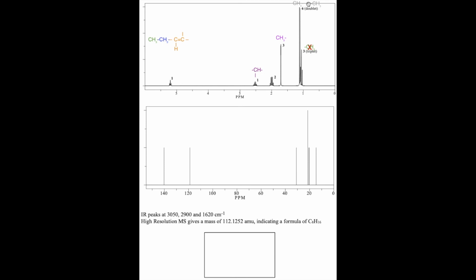So I'm going to move these methyl groups, which I know exist. It's 6 hydrogens total, and it's one type, so it's one peak, one resonance, but it's coupled into a doublet because they are both attached to a CH, and the only CH I have left that I can attach it to is this purple one right here. So now that CH should be a septuplet technically.